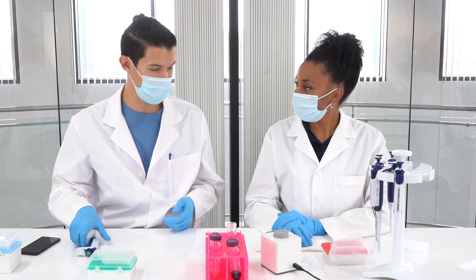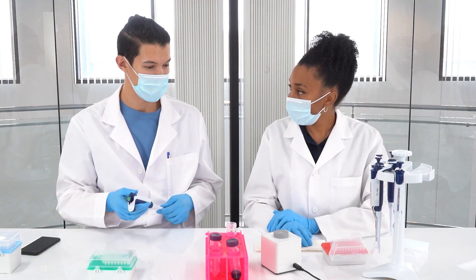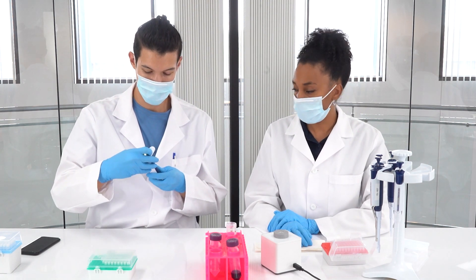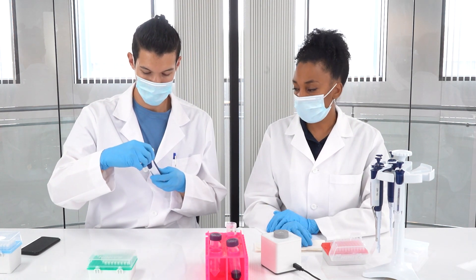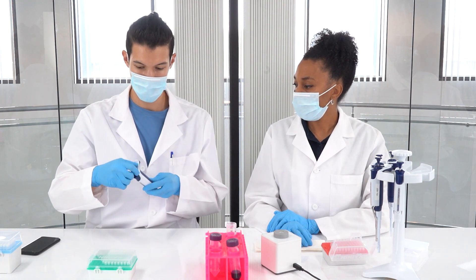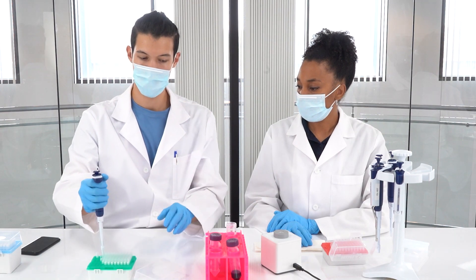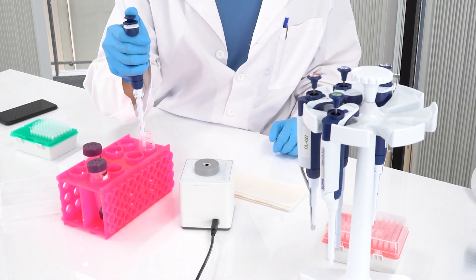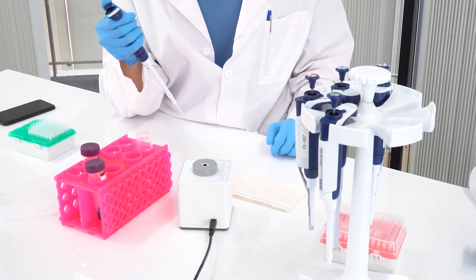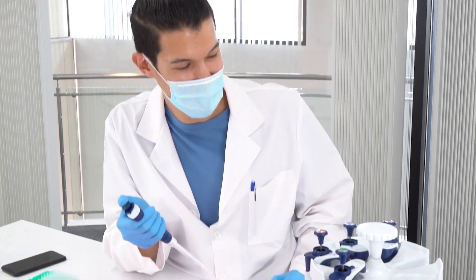Can I test my P200? Sure — there are volumes listed on the top of the unit, just pick one. Let's do 20 microliters. Just set your pipette to 20 microliters and let's see how you do. Alright, let me get a tip on here... oh, you failed!